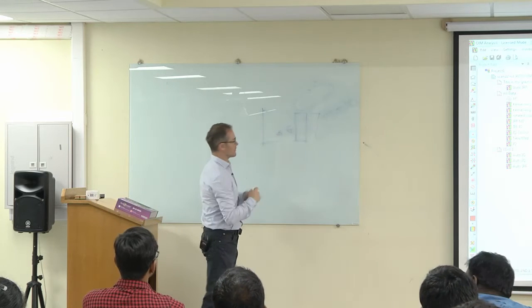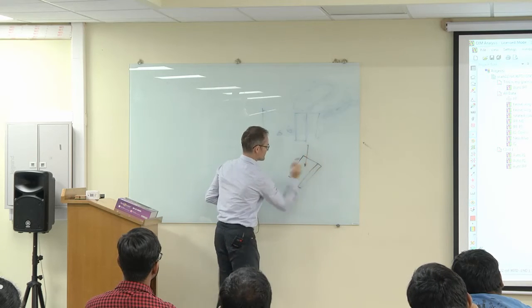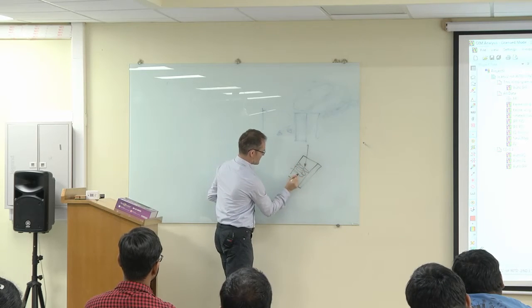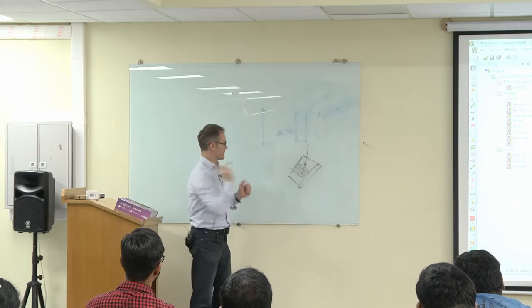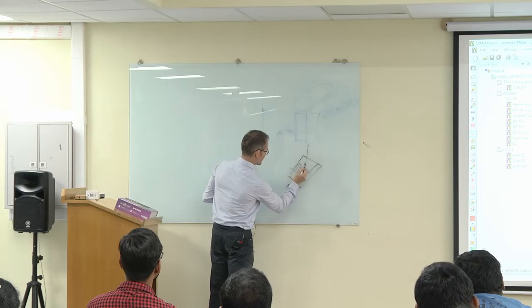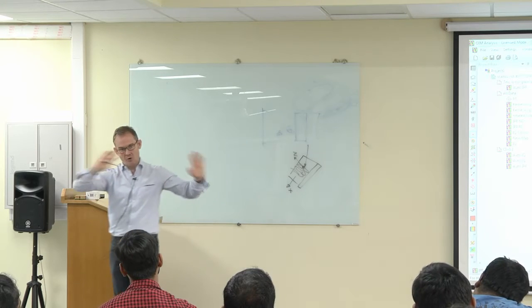We measured on that thing here, and we placed our sample like that into the microscope. The electron beam came here, and our grains are here. So, okay, and now the software makes an assumption for you, which you are probably all aware, to think that you have put your sample into the microscope with this direction being X, and the normal direction of that sample, out of that sample here, so out of the board, being Z. This is the usual convention taken in the OIM software.